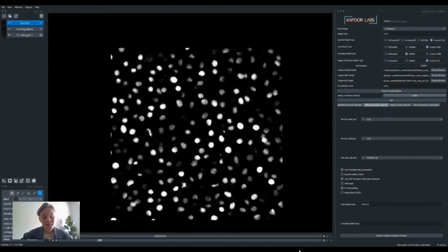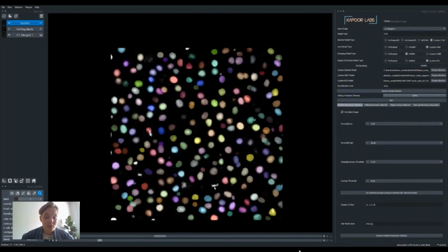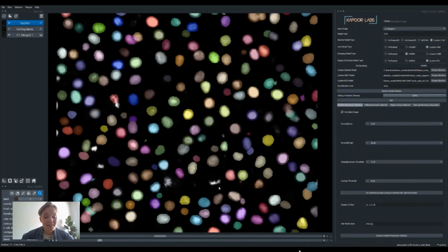Now, to quickly show you the advantage of seed pooling in VollSeg, I got another example where I have mitotic cells in my data set. For example, right there and there. Now, when I apply Stardist with the optimized parameters for the whole data set, I actually sometimes end up with predictions where these mitotic cells are either not segmented or they are quite missegmented.